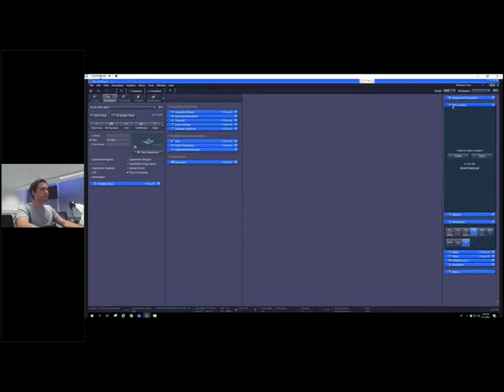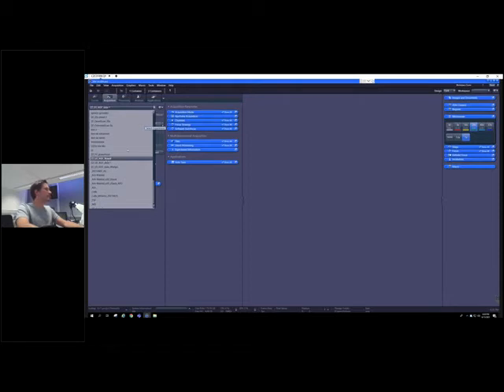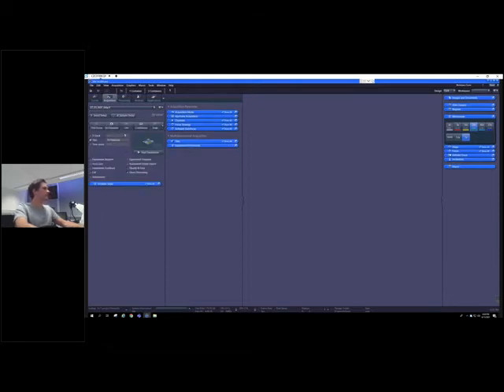Okay, so for the next experiment, let's directly go to the next experiment setup, and let's start another round of AI sample finder. All right, again, just start the AI sample finder and start the sample finding process.